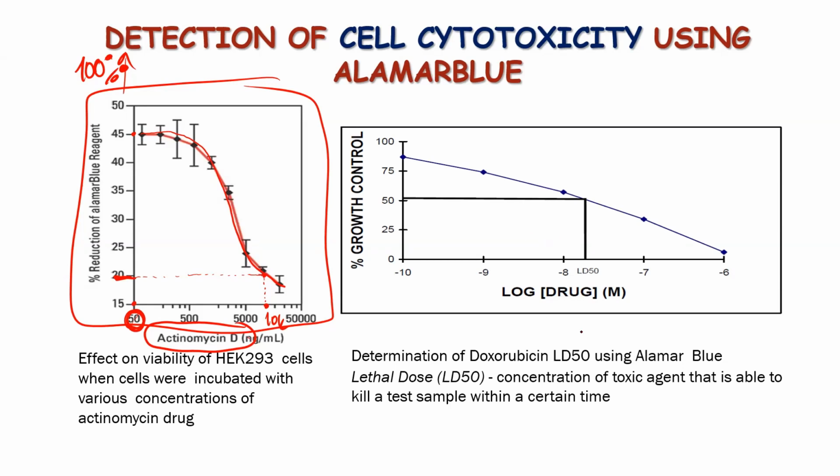Okay, so on this slide, you see the logarithmic distribution of the concentration of the drug. With this logarithmic distribution, you understand at what concentration you have 50% death of your cells. Why would you want to know it? Because it actually tells you much about the cytotoxicity.